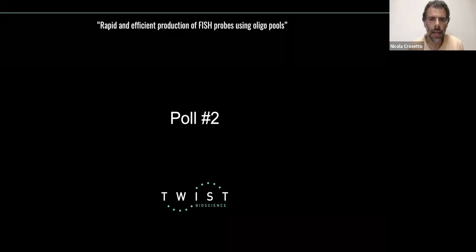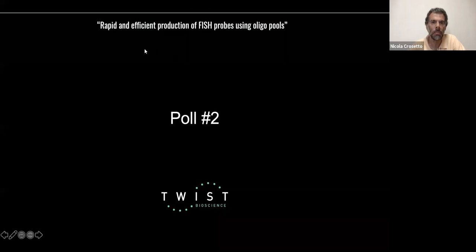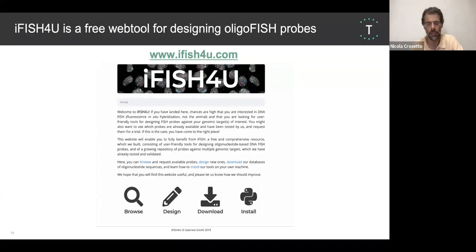Excellent. So we have the winner: high resolution DNA FISH to study chromatin. That's also the main interest in our lab, but also a good portion of you are interested more in diagnostic application and smFISH. I want to highlight that what I'm presenting to you today is mainly centered around DNA FISH. However, we are also working towards making our tools, the web tool I'll show you in a second, applicable also to RNA FISH.